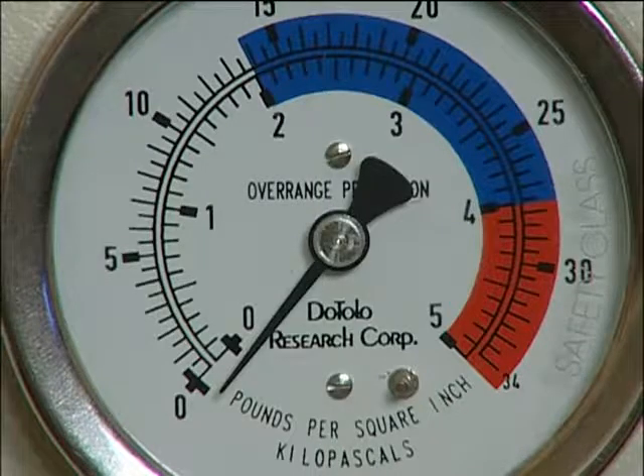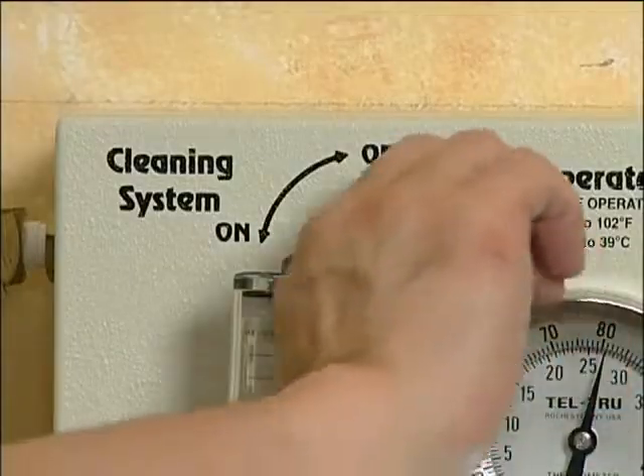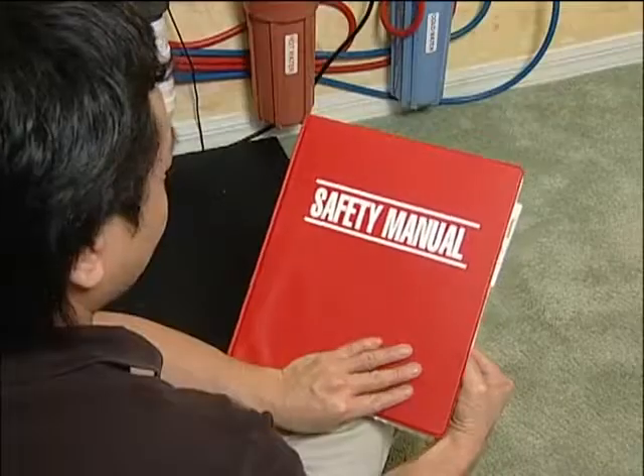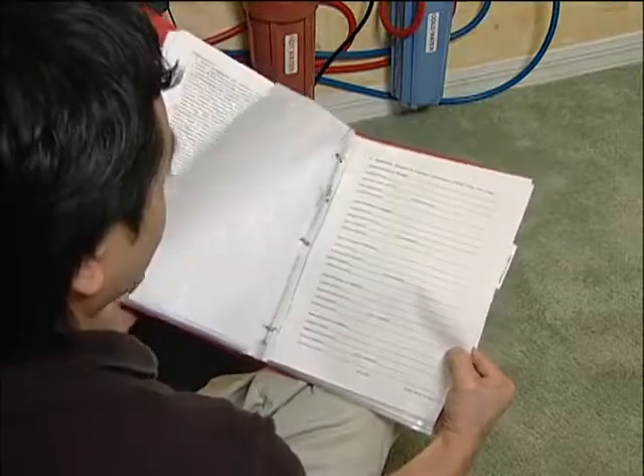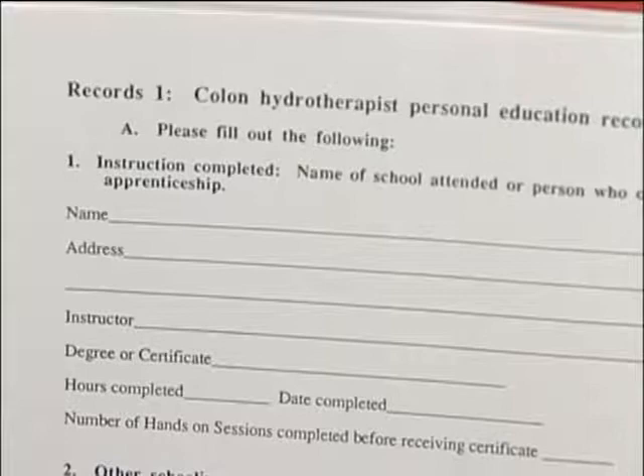Do not allow the pressure to exceed 5 psi, as doing so could cause damage to the pressure gauge. Now turn off the valves and shut off the cleaning system. Your instrument is now ready for use. Included in your shipment was a safety manual — please turn to page 31 and complete the equipment installation record.